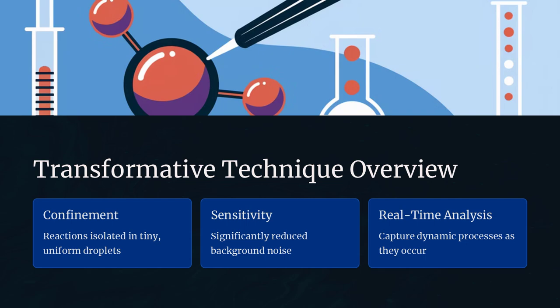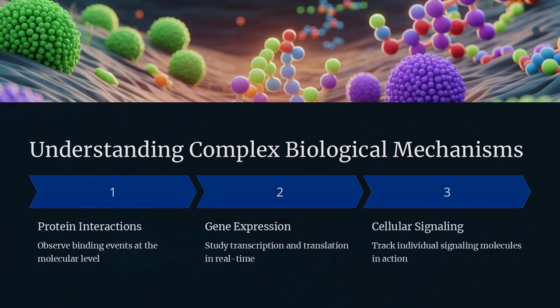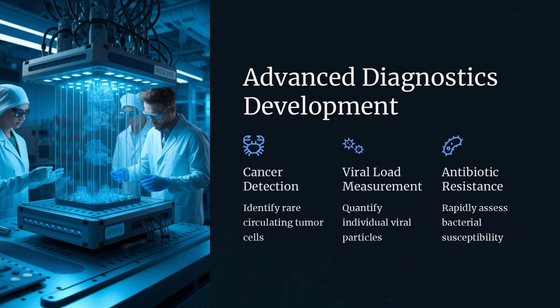Despite these impressive advances, several challenges remain in the field. One of the primary difficulties is maintaining the stability of microdroplets over extended periods, especially when experiments require long observation times or involve multiple sequential reactions. Droplet coalescence, evaporation, and unwanted interactions with the channel surfaces can all affect the reliability of the measurements. Researchers are addressing these issues by developing improved surfactant formulations and microchannel coatings that reduce droplet instability. Additionally, the design of the microfluidic chip itself is continuously evolving to incorporate features that minimize these issues, such as integrated valves, flow-focusing junctions, and temperature control elements.